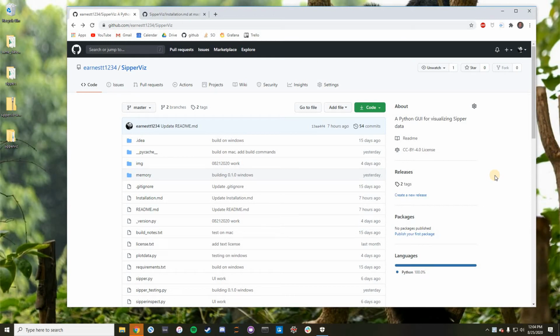Hi there, this video is just going to go over how to install SipperViz as an executable file. So that just means a file that you can click on to run and SipperViz will start.